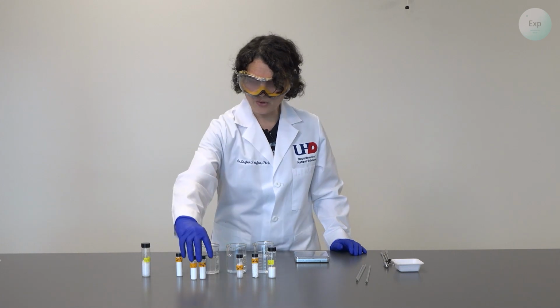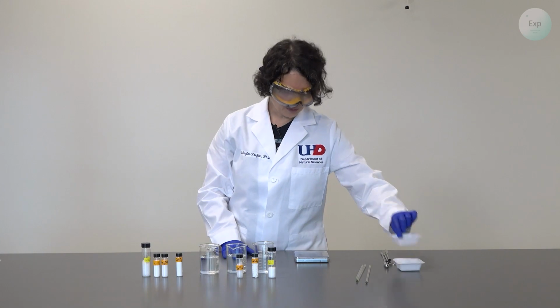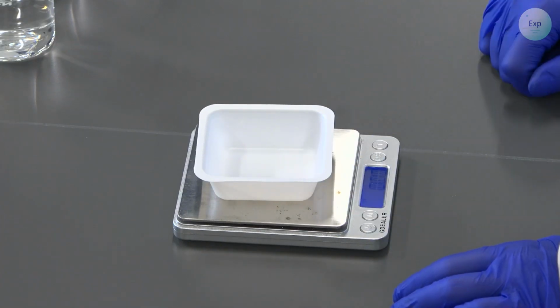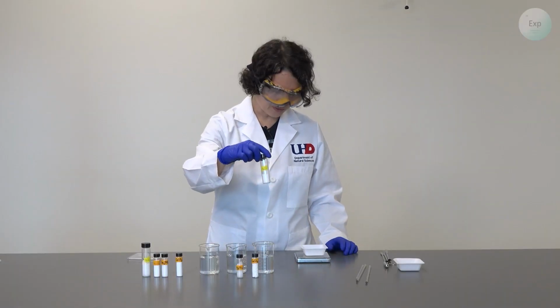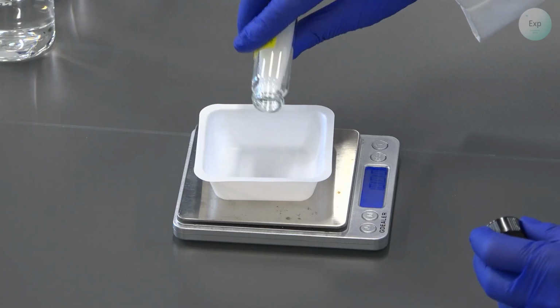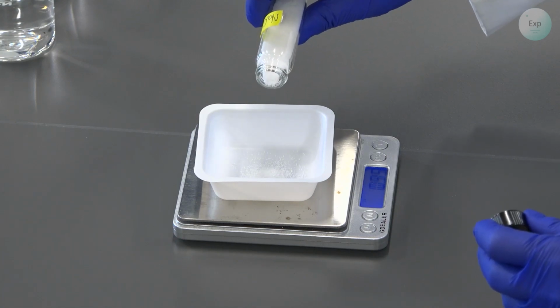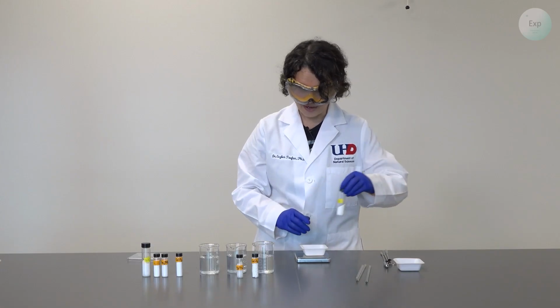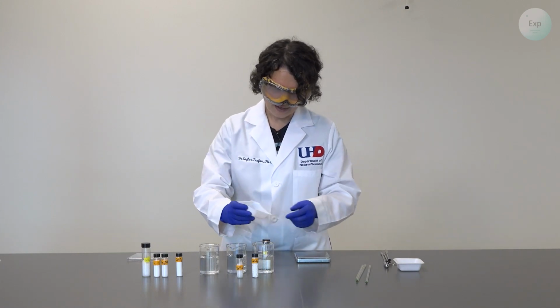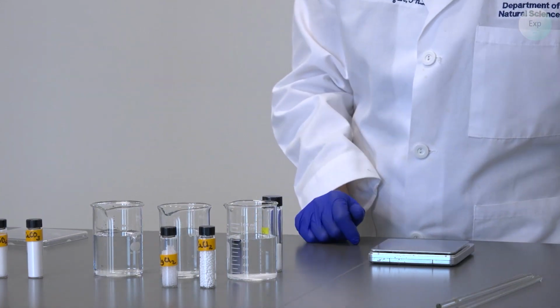Of each of these chemicals, I will measure exactly 1 gram in individual weighing boats. So I will turn on my scale, place a weighing boat on top, tare it, select my first chemical, that is sodium chloride, and I will measure 1.00 gram of this. I have exactly 1.00 grams. I will leave it next to my first cup, and I will transfer it in there. And then I can set my weighing boat to the side.